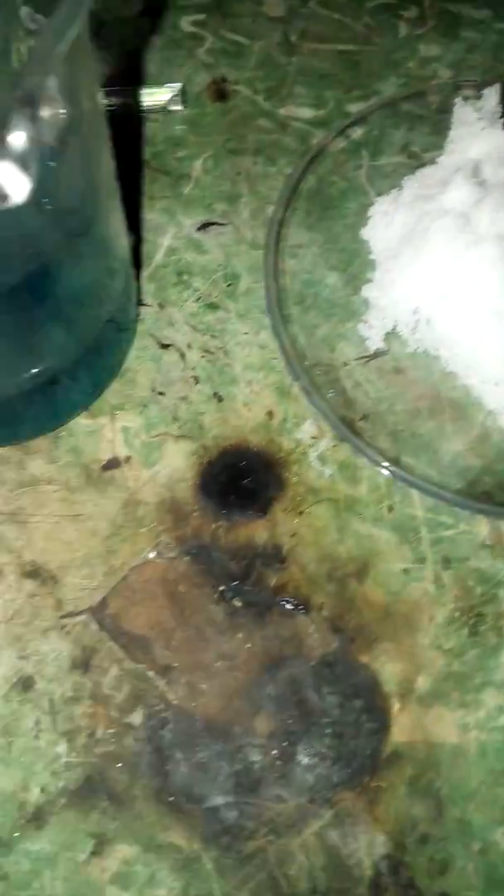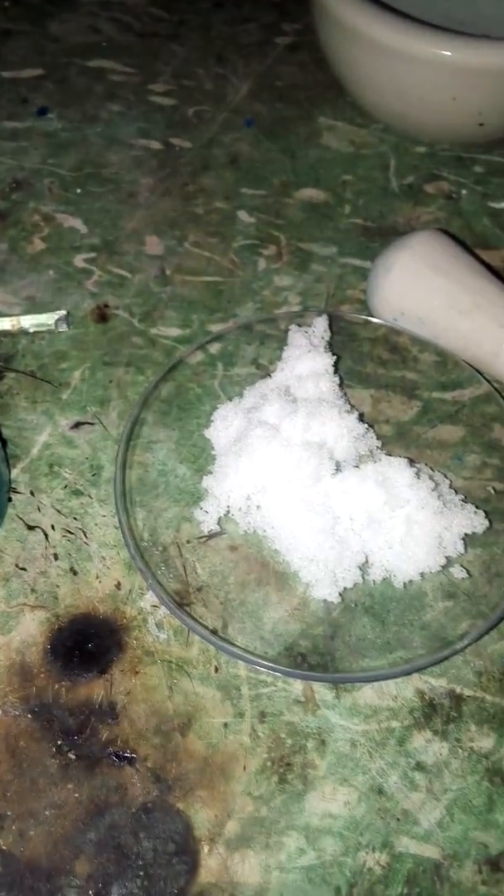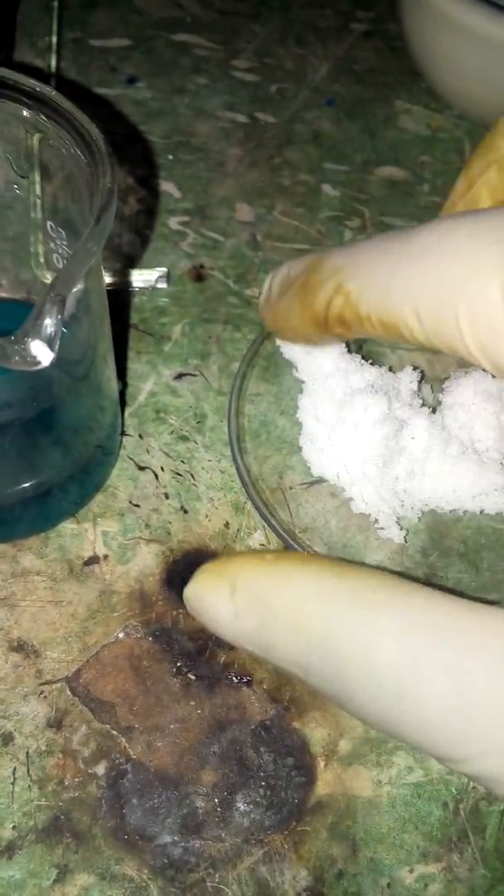When you mix sulfuric acid and table salt — which is sodium chloride — it's gonna produce Na2SO4 (sodium sulfate) and hydrogen chloride gas. So that means you can actually make hydrochloric acid from table salt.